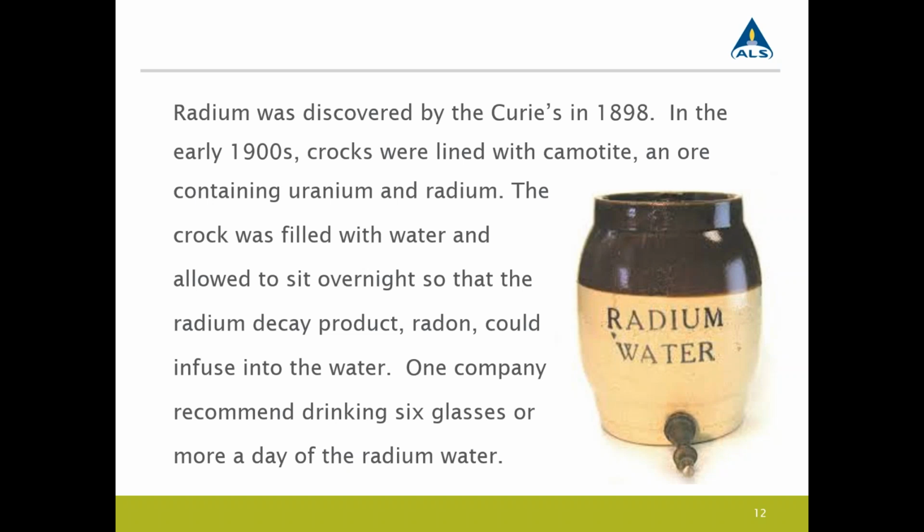What are the pros and cons to each method for testing radium-226 and radium-228 in produced water samples? The gamma spec analysis for radium-226 and 228 in a water sample can be done, but it has significantly increased detection levels over using one of the other methods. So we do not recommend it for waters. It just doesn't have the sensitivity that you're going to get with either alpha scintillation or gas flow proportional counting.